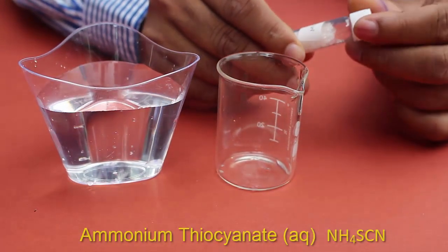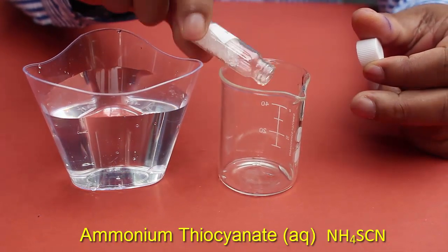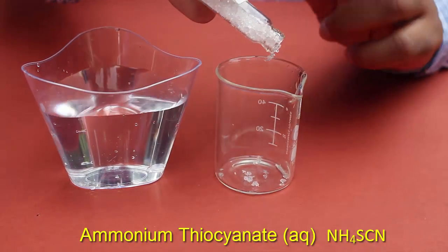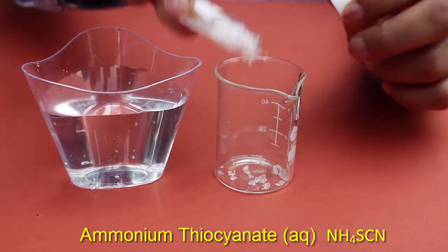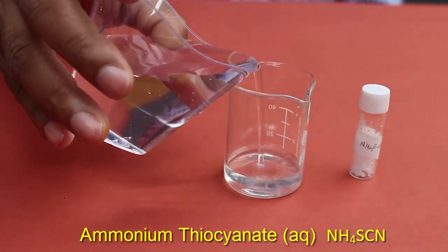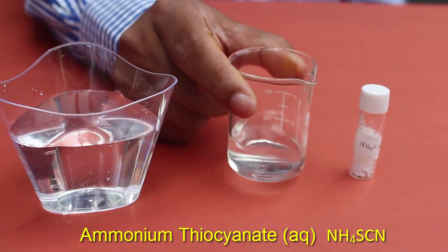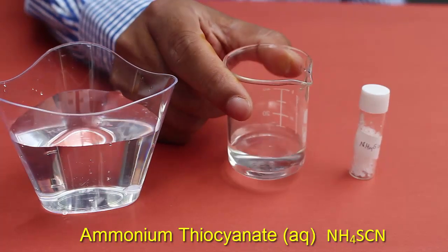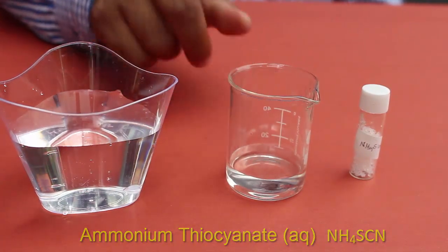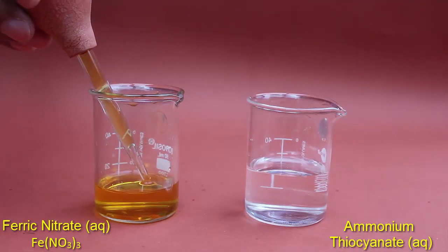Now we are going to prepare a solution of ammonium thiocyanate. These ammonium thiocyanate crystals are added into an empty beaker, then water is added. The ammonium thiocyanate easily dissolves into the solution. Now we are getting a very clean solution of ammonium thiocyanate. Now we are going to mix these two solutions.